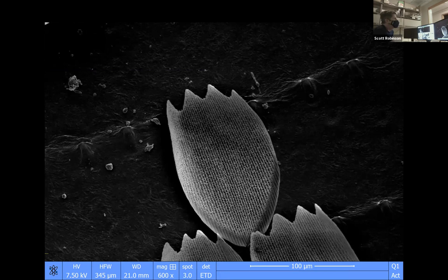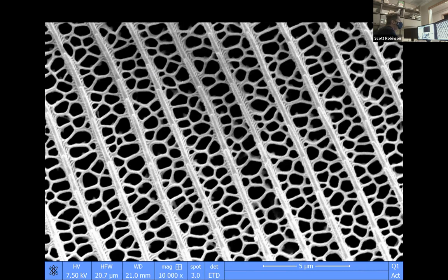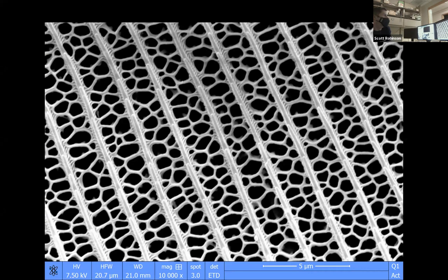And you can see, if you can see the micron bar, that they're about a tenth of a millimeter across. They're really, really small. And then they have these little ribs that keep the structure straight. Between those ribs, they're about 2.5 microns from rib to rib. And what's really neat about these is they create structural colors.